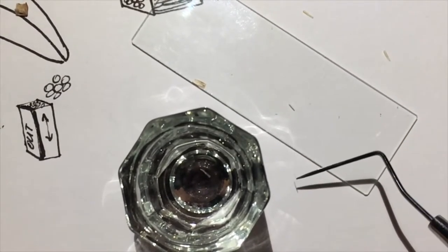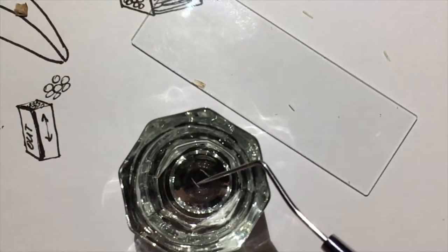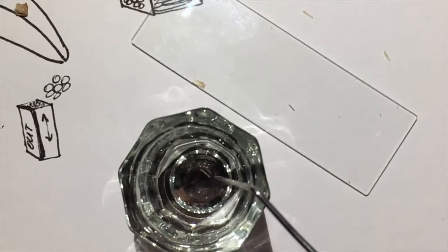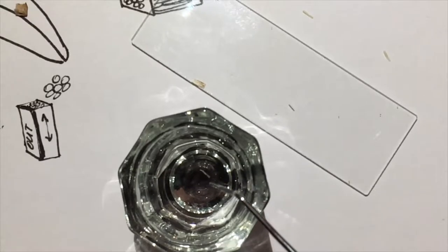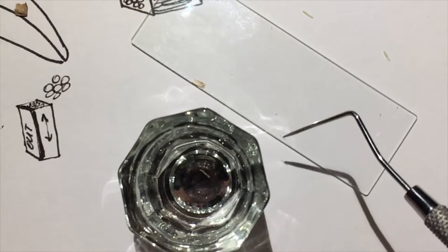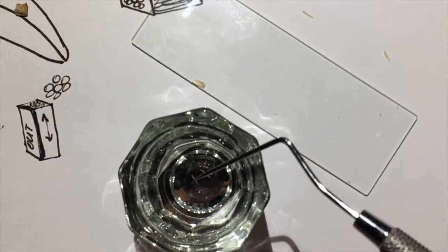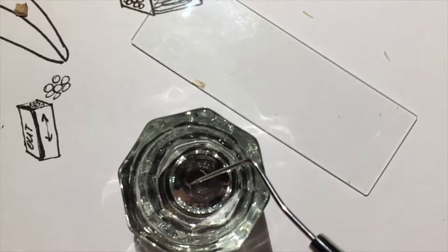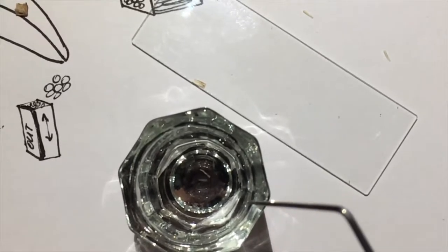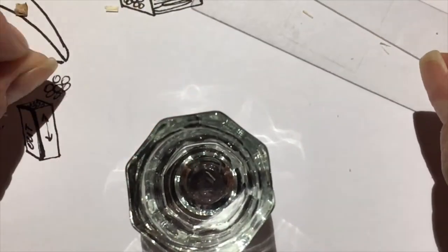This one is so thin, you can only see the shadow of it. You can't really see it. So this is probably going to be good. See how transparent that is, floating in the water, and the alcohol, this one's pretty thick. Let's go to our last one. Again, so thin that you can see the shadow, but you can barely see it. I like that one. Seems like I got more area. So, let's move our section.